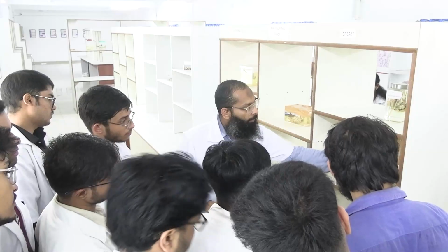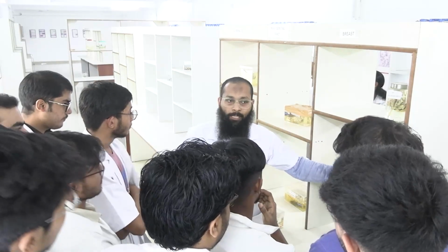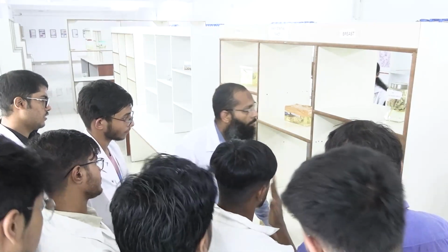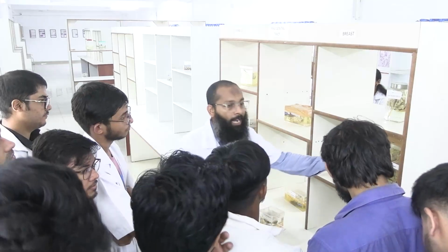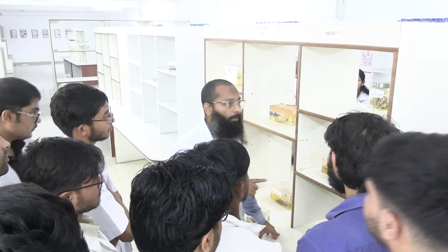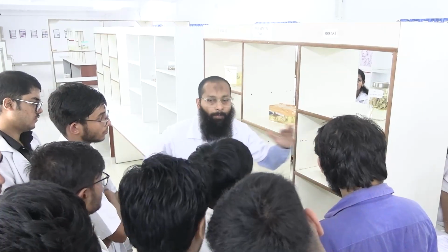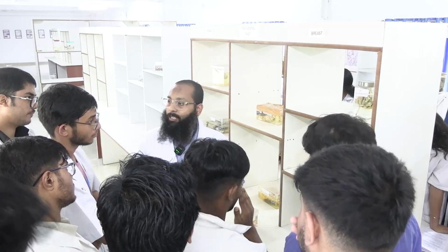Now after putting the specimen in a fixative, it is sent to the pathology lab, and grossing will be done. Before grossing there is a step called pre-gross, which I mentioned in class, didn't I? Okay, fine. What is pre-gross? The penetration power of formalin is 1 centimeter.